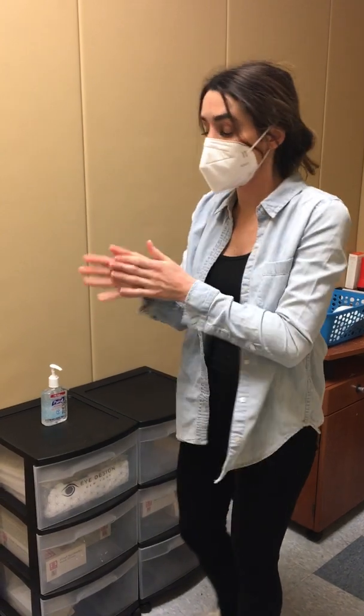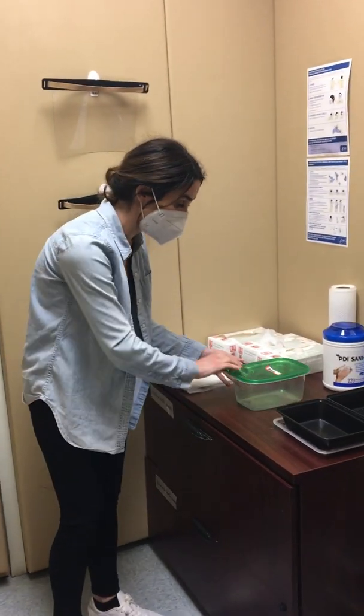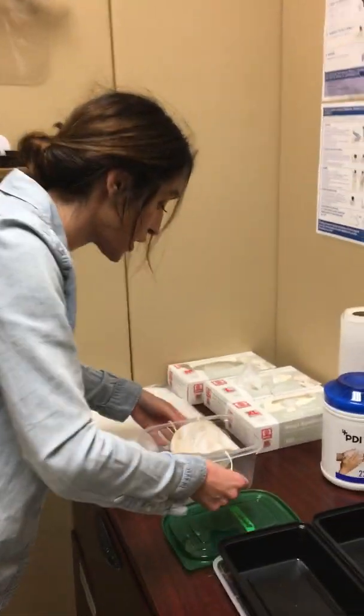And then the last piece of equipment I have to take off is my mask. And again, because I'm going to reuse this, I'm going to grab my labeled container. And again, you would have one of these as well. When I remove this, I would simply want to take the ear loops like I would with any other mask, and I would just take it and drop it into here.